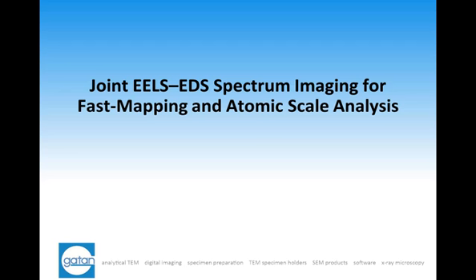We'll be talking about using EELS and EDS together for spectrum imaging for doing fast mapping and analysis at the atomic scale.